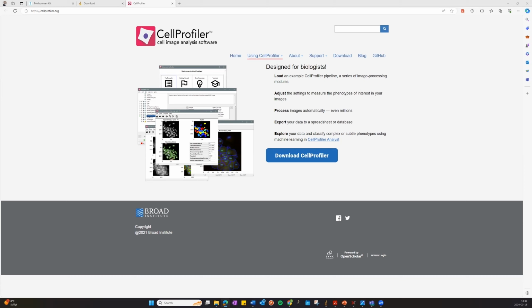Any image analysis software that can achieve such segmentation and then quantification can be used to analyze the MolBoolean results. One image analysis platform that can be used to analyze the MolBoolean results is the freely available CellProfiler image analysis software, developed by the Broad Institute of MIT and Harvard. The first time MolBoolean image analysis is performed, you will need to download the CellProfiler software. And instructions for how to download CellProfiler software can be found in the MolBoolean instructions for use.